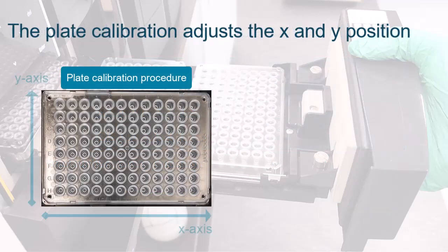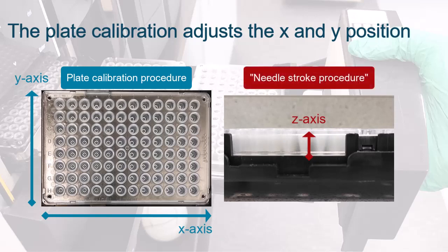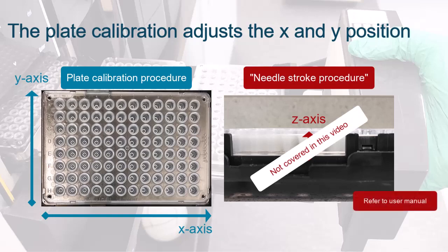Note that this procedure will only adjust the X and Y position of the injection needle during sample aspiration. Adjusting the vertical position, that is the Z-axis, uses the needle-stroke procedure, which is not covered in this video. It is described in the user manual.